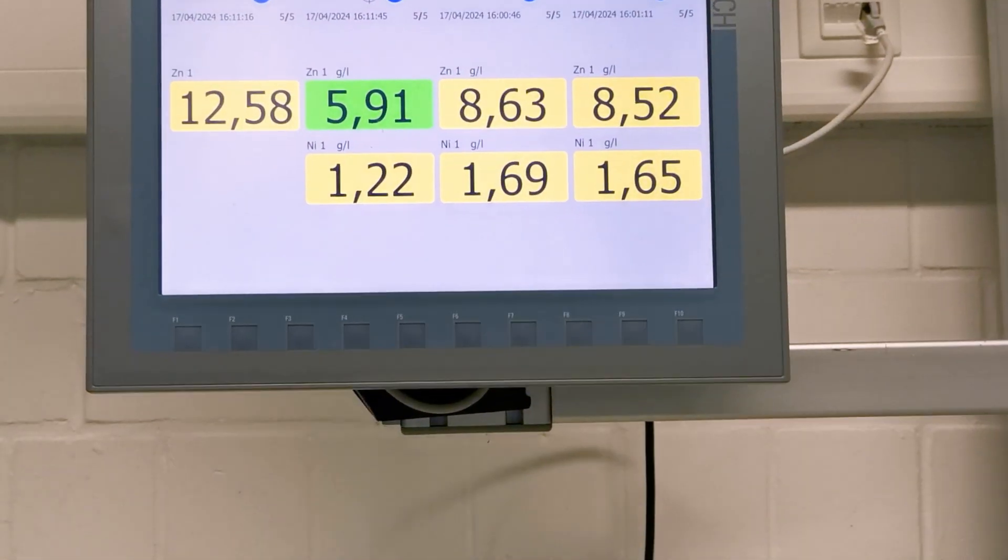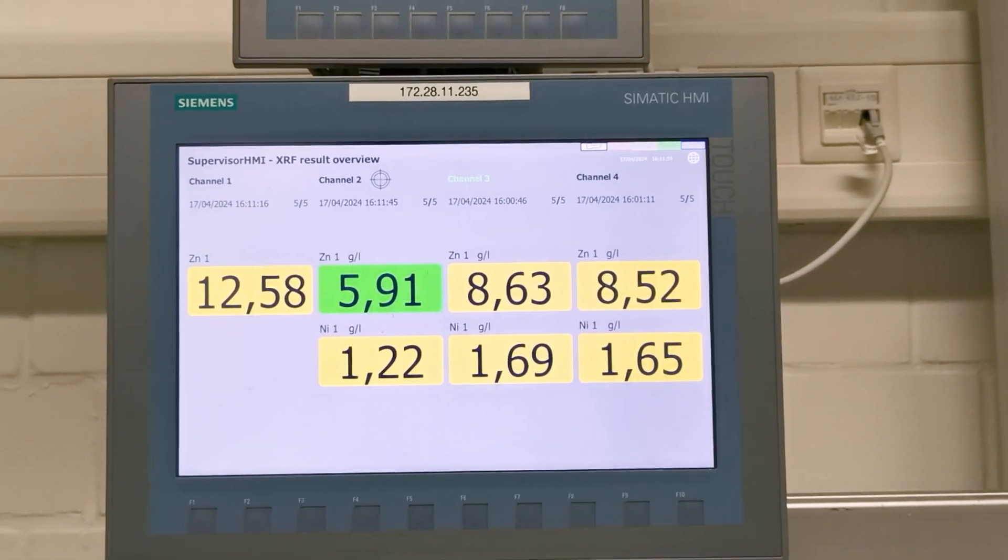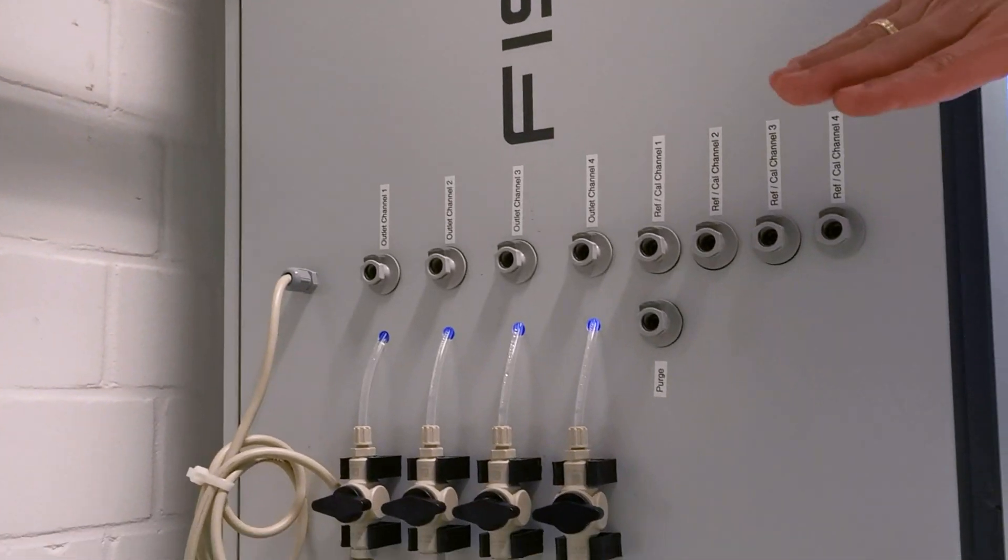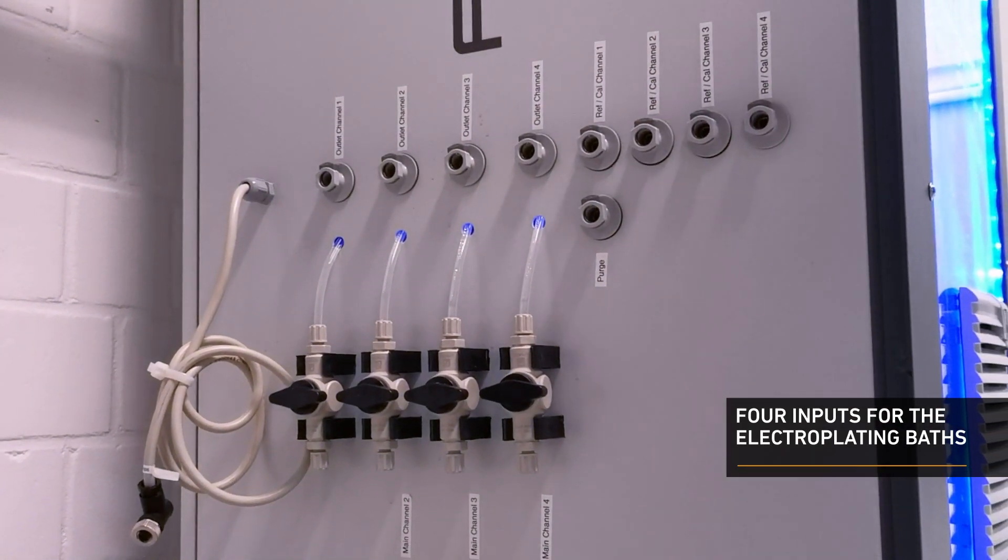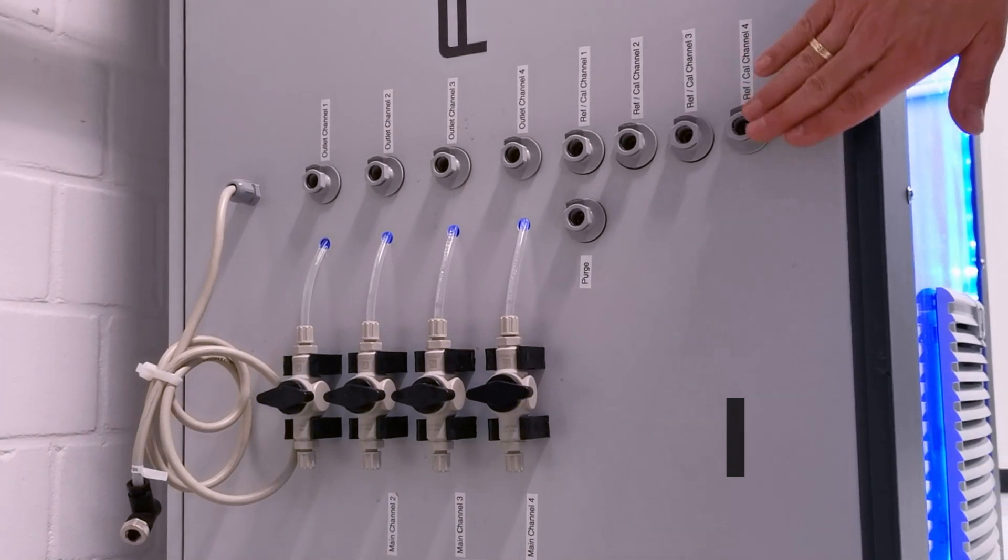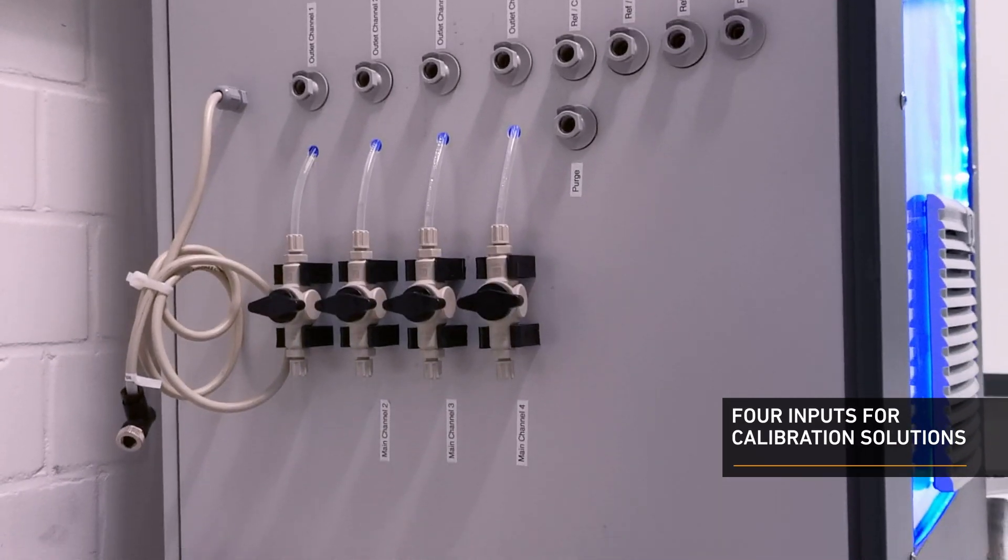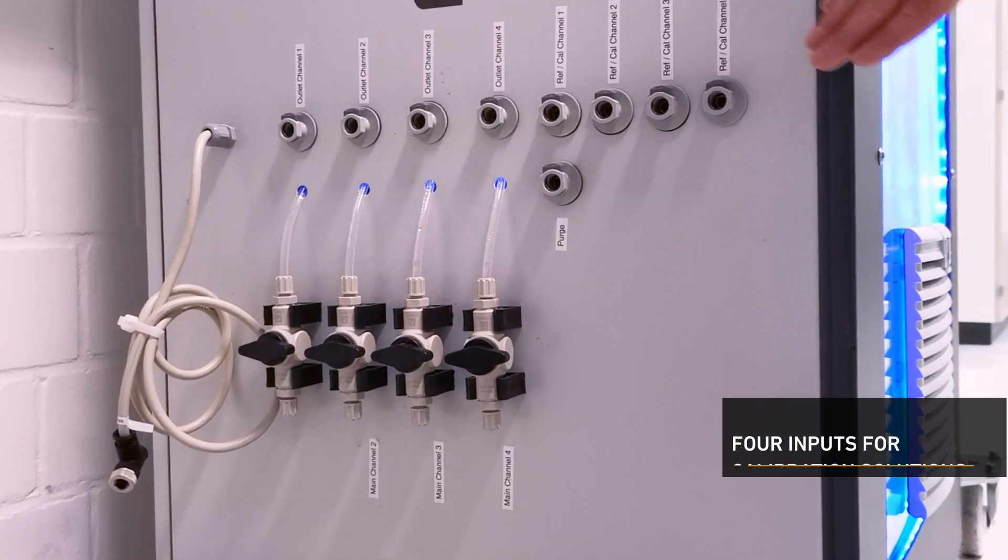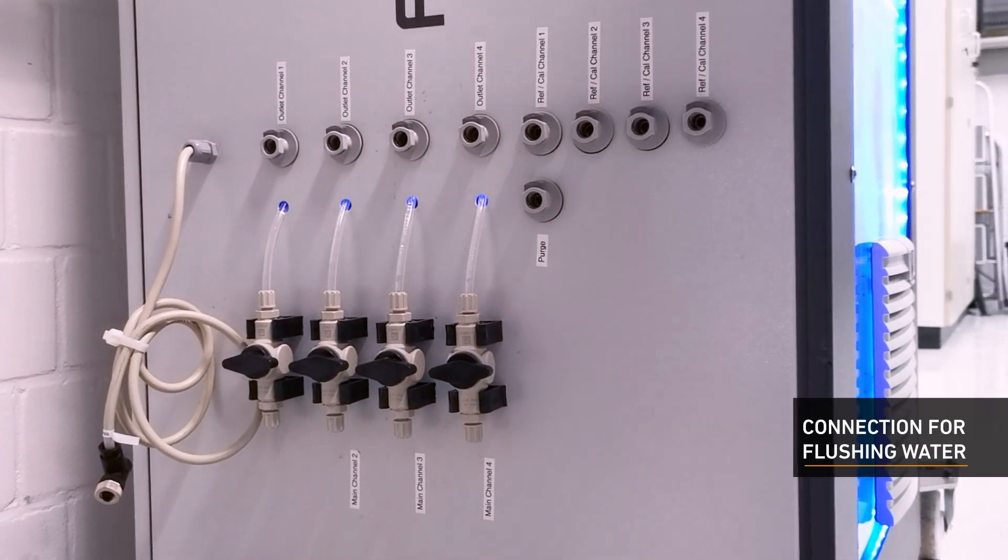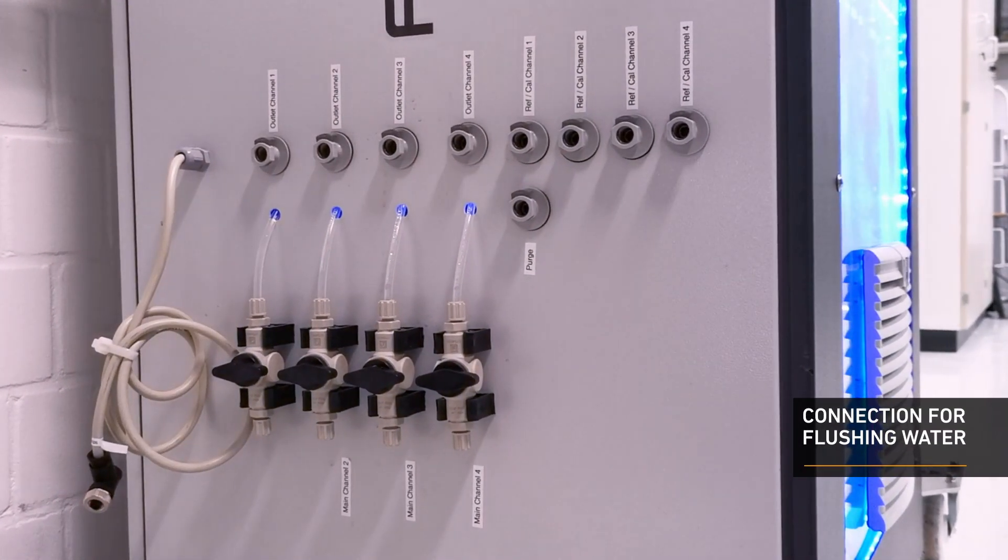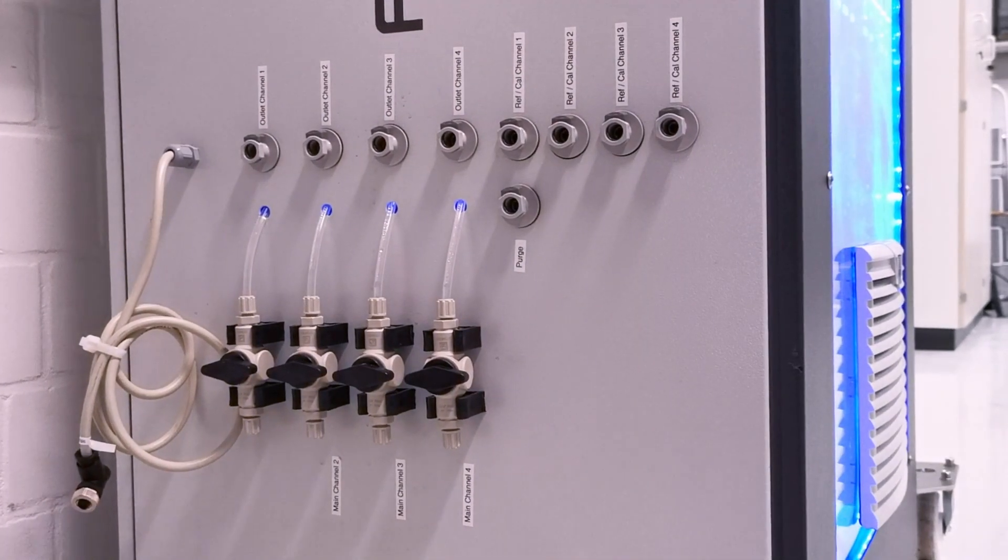We connect all your four plating lines on the inputs here on the left-hand side. We measure automatically your liquid baths. We can automatically self-reference and self-calibrate every individual channel, and we can automatically purge any individual channel.